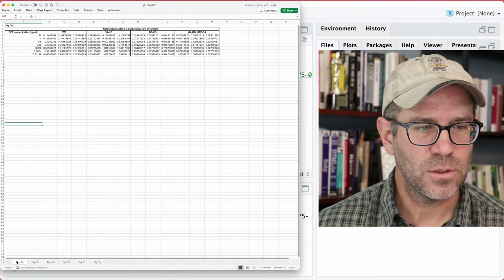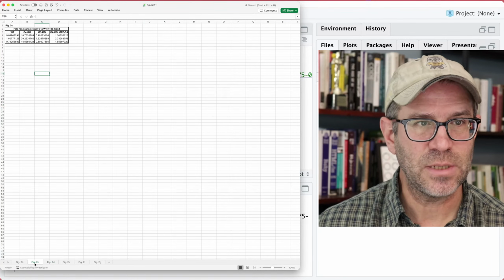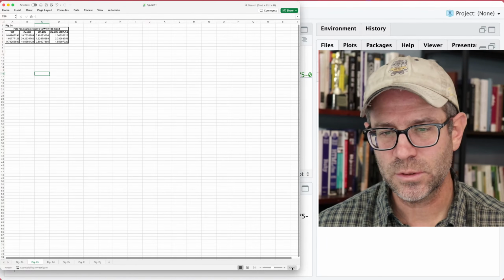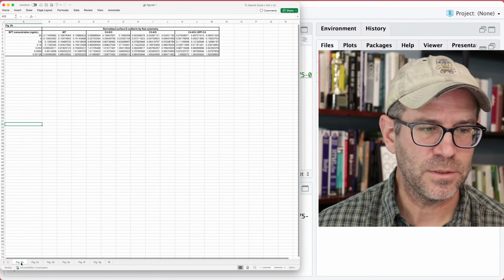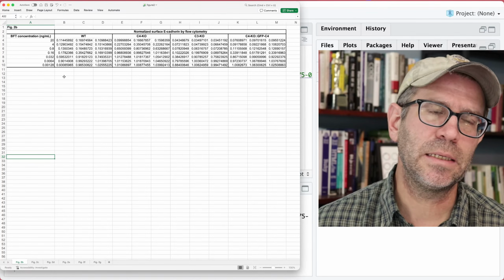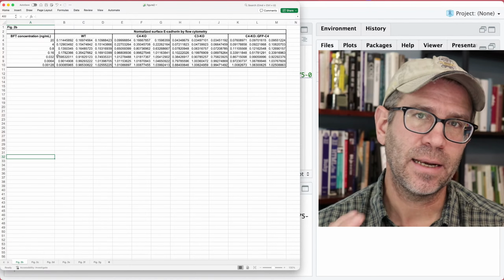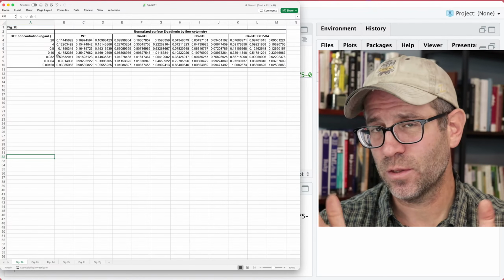Go away. All right. So again, we're going to be looking at panel 2B, and panel 2D we can see is a similar type of information. Panel 2C, it's good to know this is here, but I'm going to ultimately get this data, I think, out of the curve fit is my plan, okay? And so, yeah, we can see this table is not tidy, so we need to do a bit of work to read this in and get it into a tidy format so that we can then plot it, do a curve fit, and do all the other great stuff we want to do.